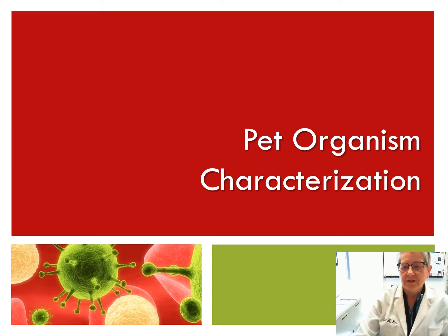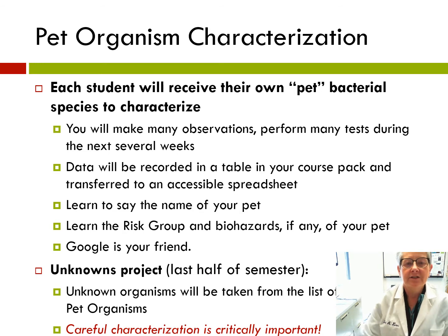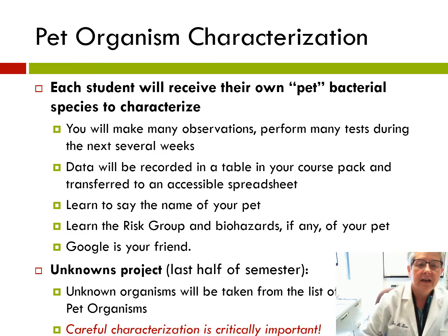Hi, this short lecture will introduce you to the Pet Organism Characterization project that we'll be completing over the next few weeks of the course. And I'll reiterate some of the things I already sent you in the email over the weekend. So each student receives their own pet bacterial species to characterize. I've already assigned you yours.